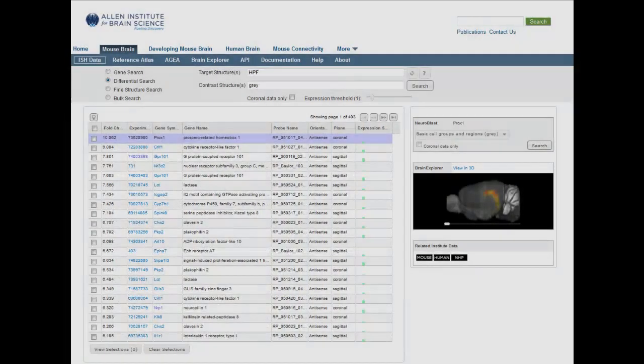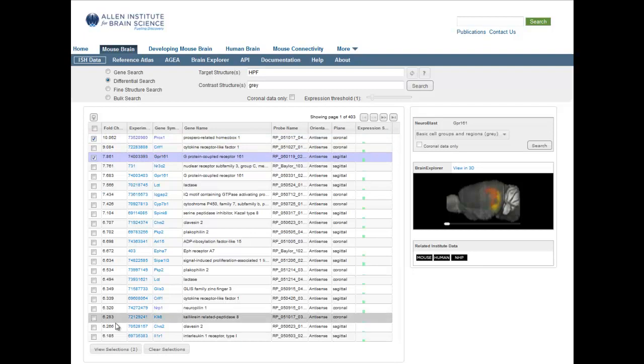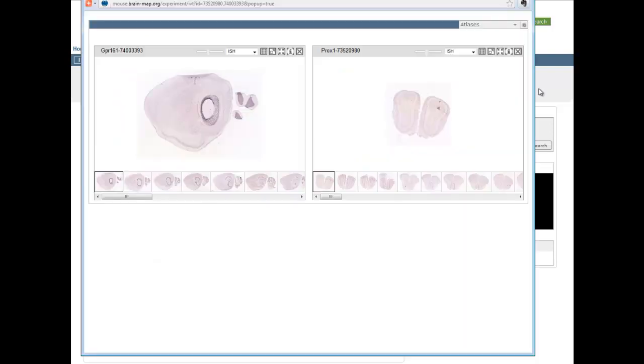You may want to explore the expression patterns of several genes at the same time. To do this, select your genes by clicking the checkboxes next to the experiment you'd like to view, and press View Selections.